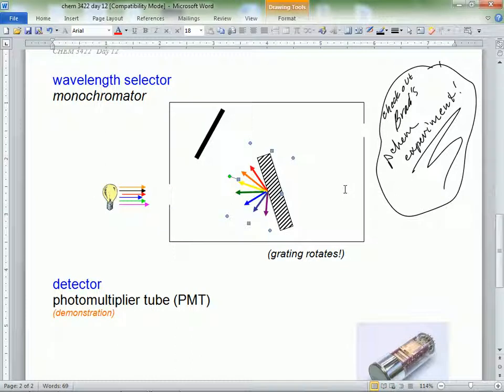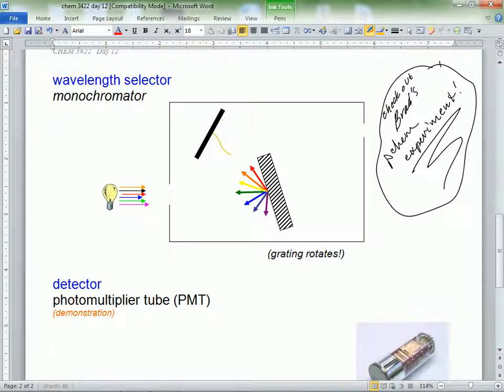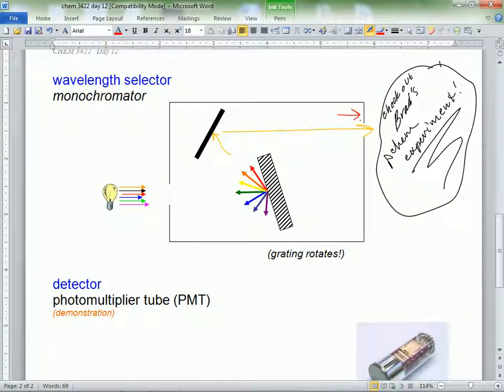So then all those wavelengths are coming in, but only that orange comes out. I guess that's kind of orange. But all those colors are striking, right? That'd be red, right? But they're just not making it through the slit. Right? They're just not making it through the slit.